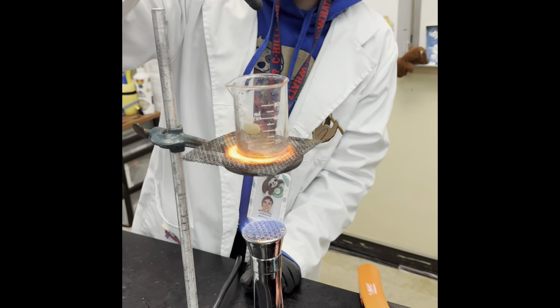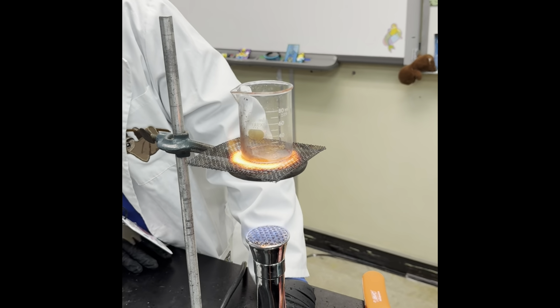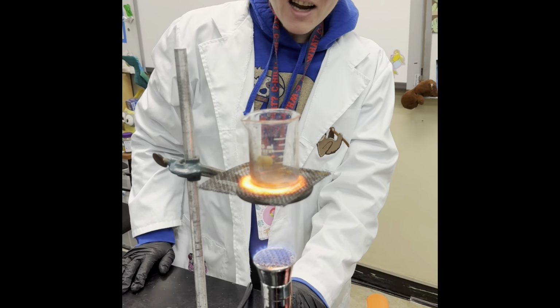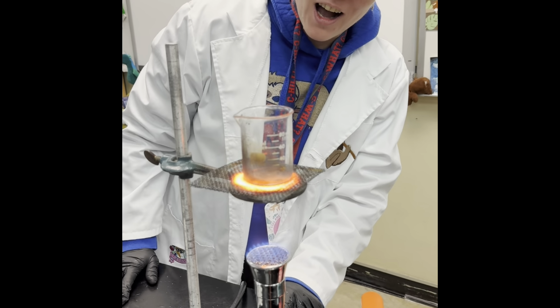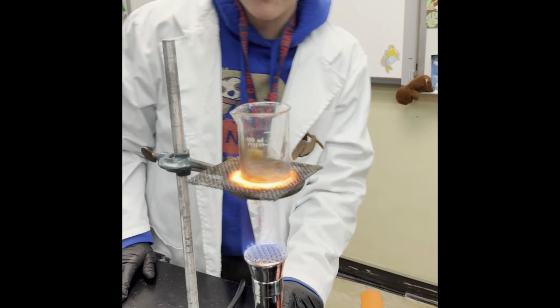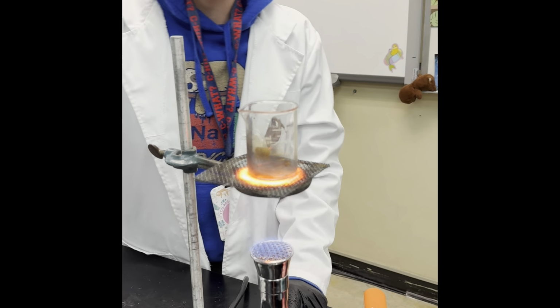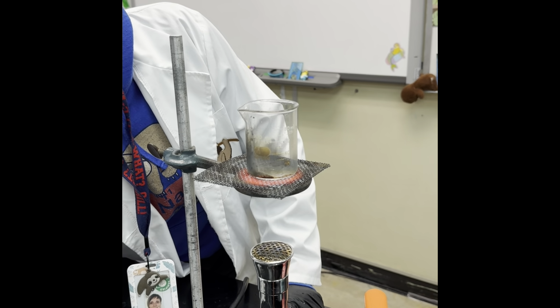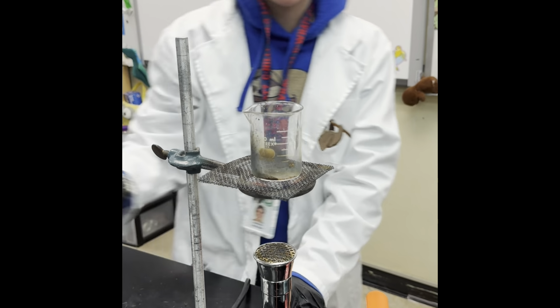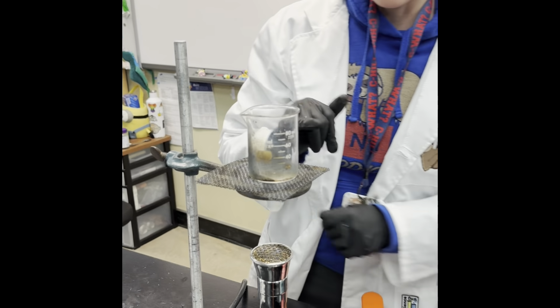Notice we're using Pyrex glass, not the knockoffs. We want Pyrex because Pyrex is heat treated, so it should withstand hot temperatures. Now, there's always a breaking point, but if you use the knockoffs, you're going to be disappointed. Okay, we're going to pause the video again.